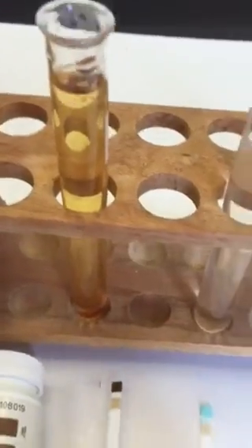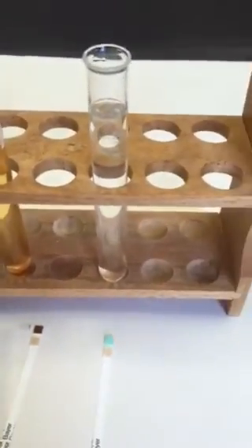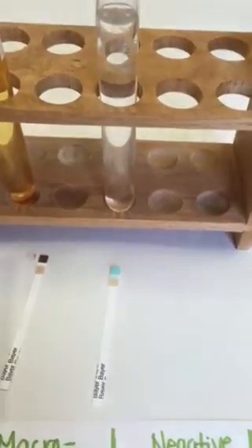So our apple juice tested positive for simple sugars, and our water, which was our control group, tested negative. The test strip remained the same and it's still this blue turquoise color.